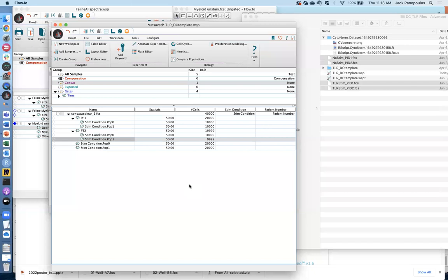So for each condition where you expect that antigen expression may change, you need to have a control, right? But it's essentially a reference control. So it's not a true testing control. It can just be a split piece of the sample that comes on day 7, right?